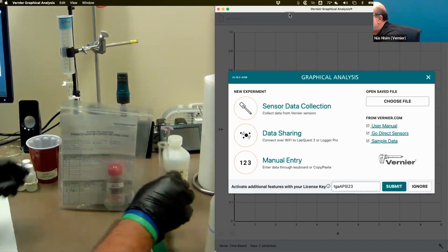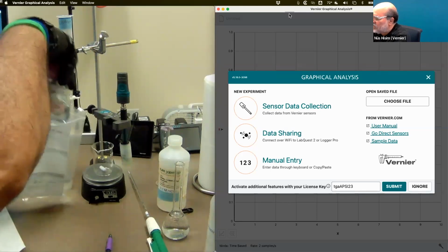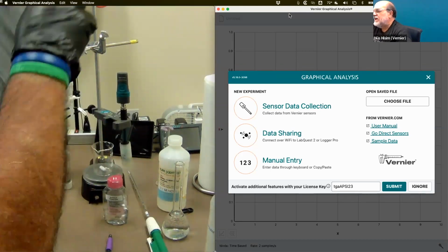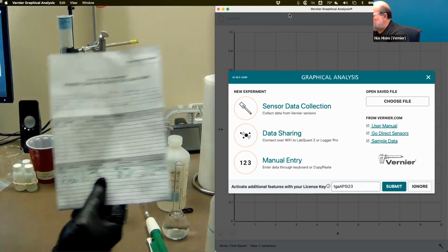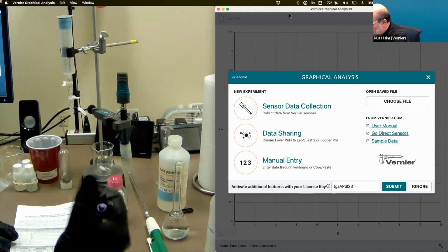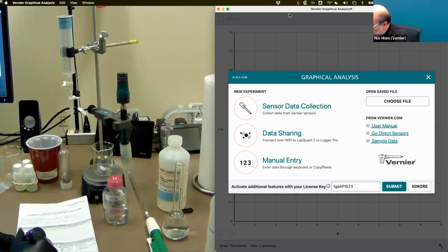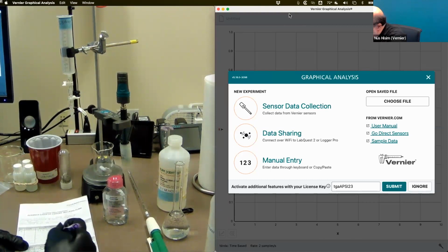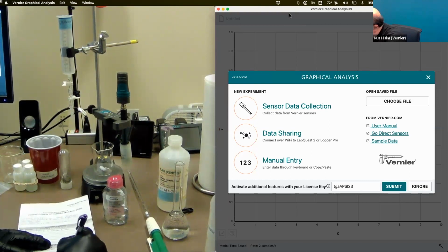So let's go ahead and get out the evidence. We are in the crime lab, so we have to maintain a chain of custody. I did put the sample of this in the shared folder so you all can get to it. I didn't check it back in yesterday, that was my fault. So I'm going to go down here. Today is the 9th, and this is received by N Hisim 007, and I'm going to do a webinar.